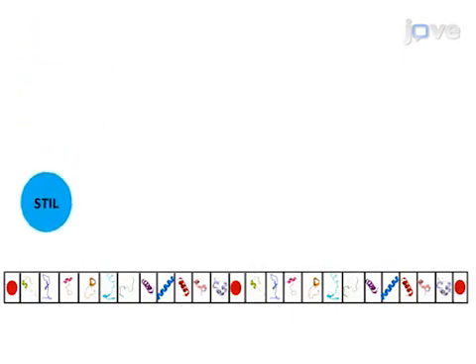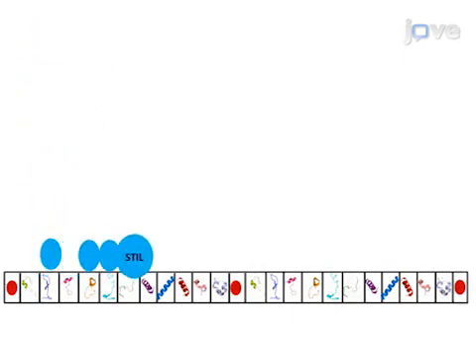The second step is to incubate the CHFR peptide array with its binding partner, the STIL protein.